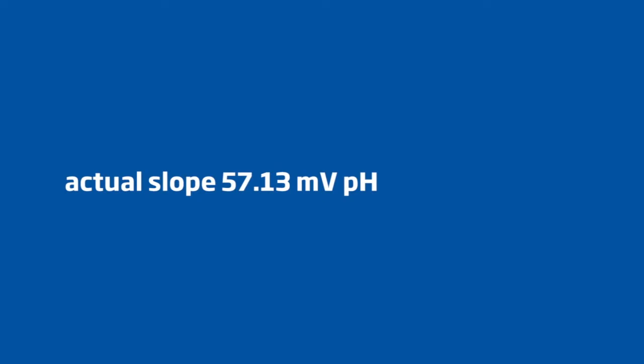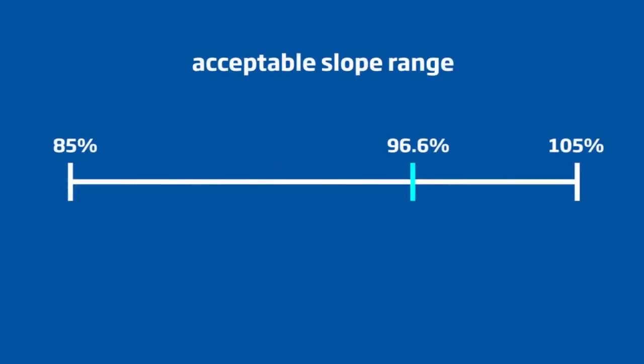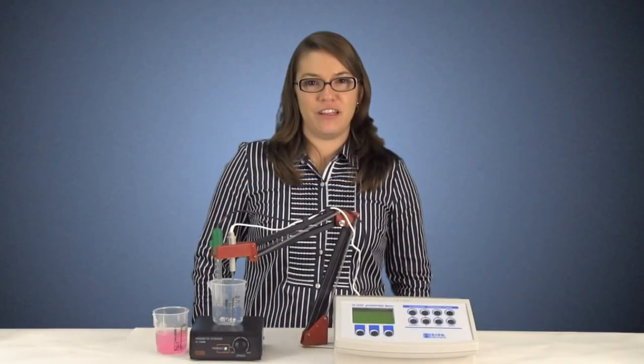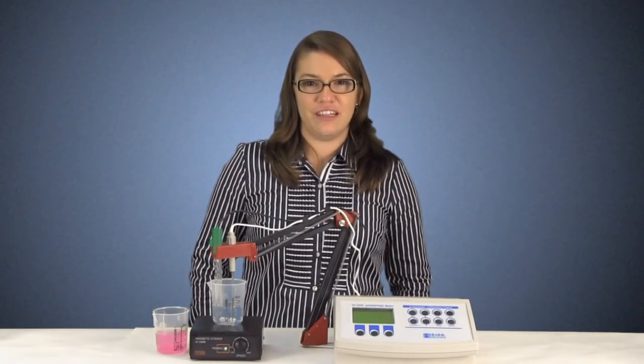We then divide this actual slope by the theoretical slope as defined by the Nernst equation, 59.16, to determine the slope percentage. The slope percentage of this HI1131B is 96.6% which falls in the acceptable range of 85 to 105%. If your pH electrode meets both these criteria, then you have a functioning electrode and you can proceed with calibration and measurement.